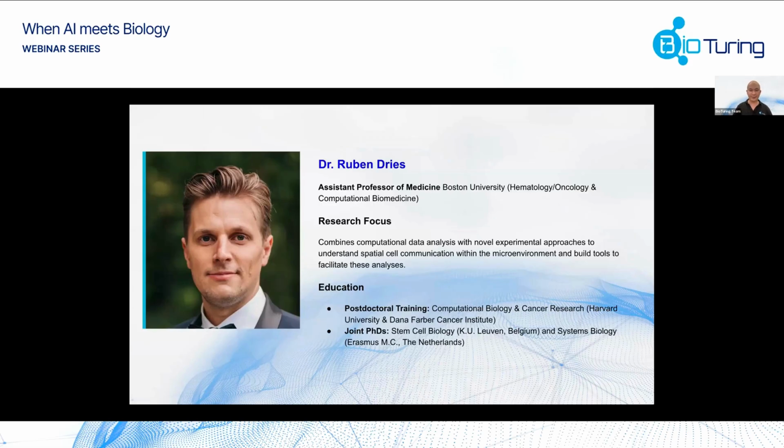If we work in spatial biology, we should at least know Giotto. This is a multiscale, technology-agnostic ecosystem for spatial multiomics analysis. Today's session is spatial multiomics across technologies and designs.